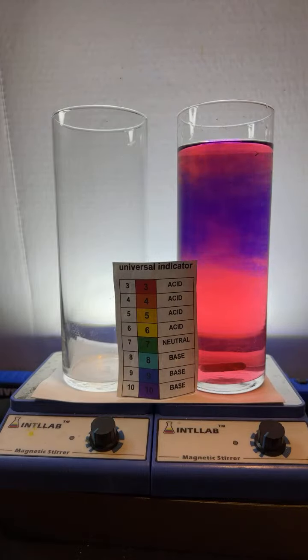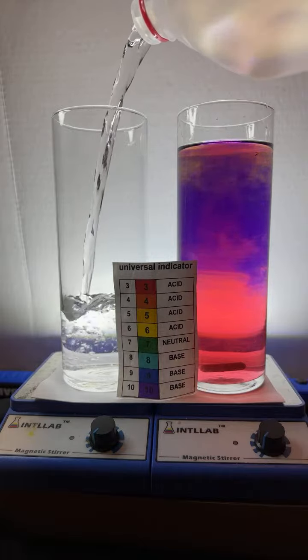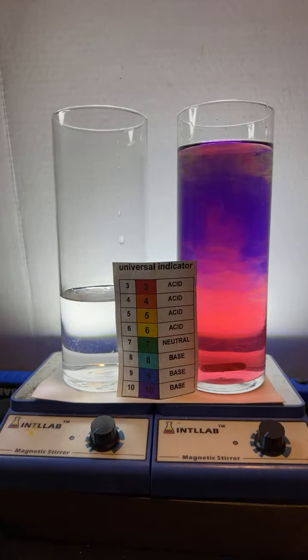Hello there, Master Pilot. Okay. So what we're going to do over here on the left is add some water. And so it gets mixed. I'm going to go ahead and put the universal indicator in. Universal indicator shows these colors at different pH values. We're seeing that happen over there on the right. Thank you there, Geo Cruz. Hello there, The Walk.